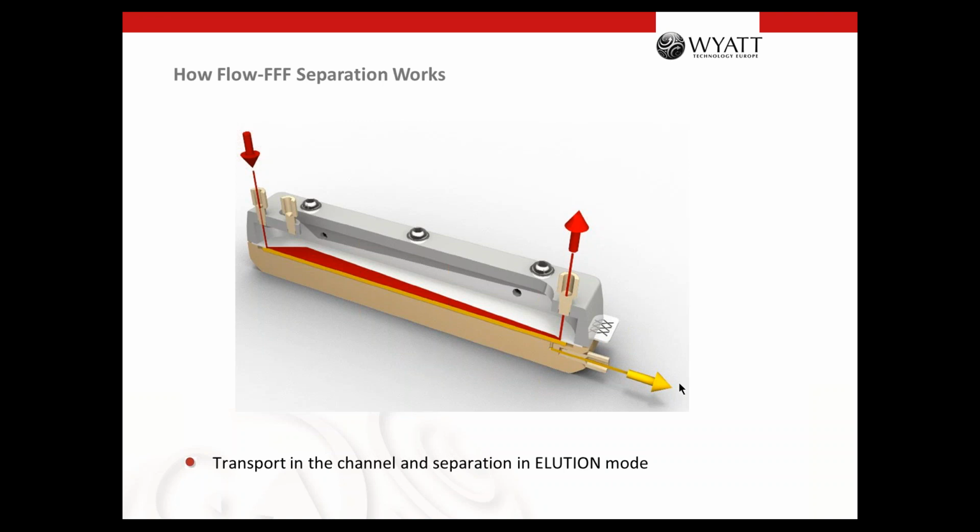And it also contains a valve. So with the measurement and the regulation, it can regulate the amount of flow more precisely than an HPLC pump, down to 0.02 milliliter per minute. So to a very, very low crossflow, which is very often useful if you want to separate very huge particles.